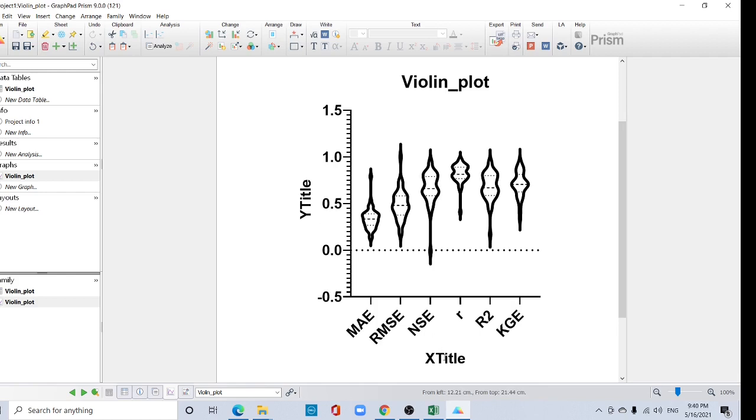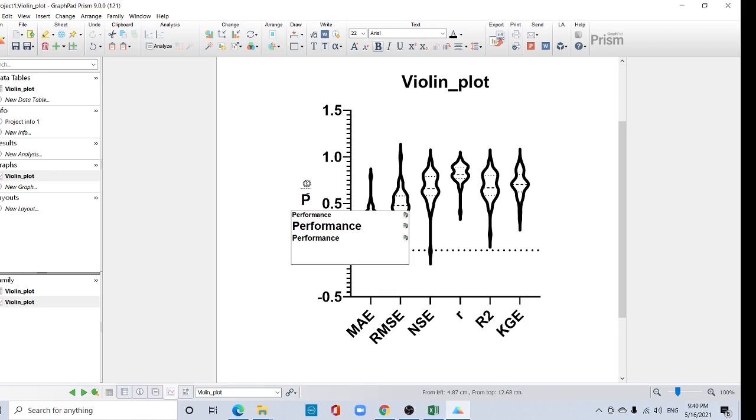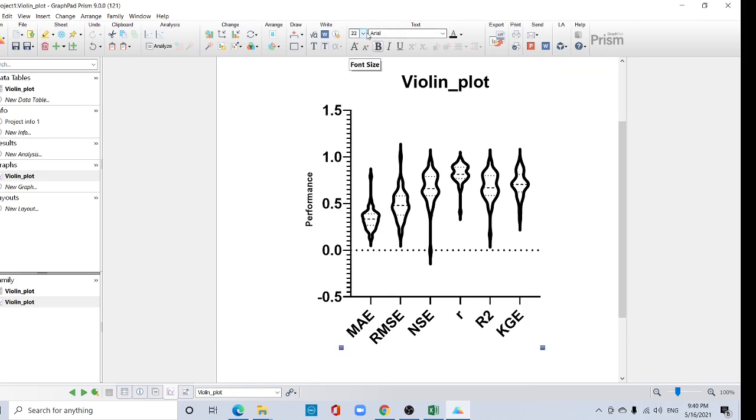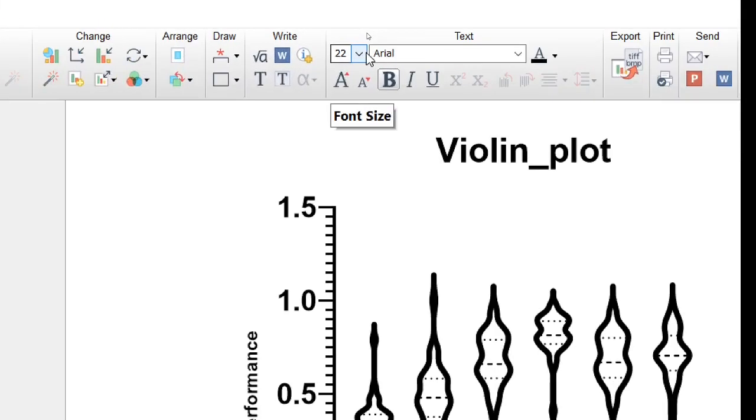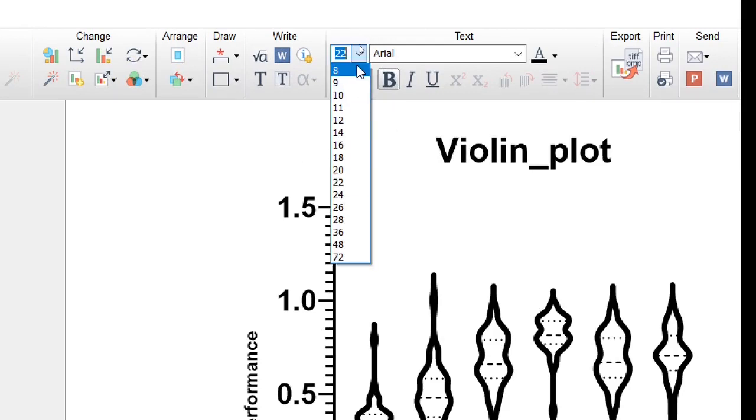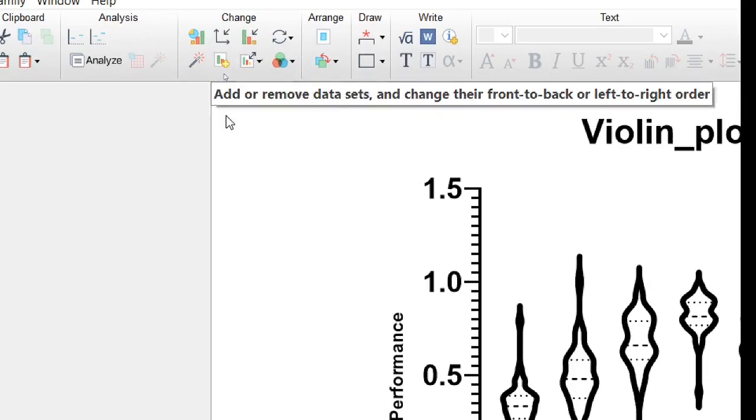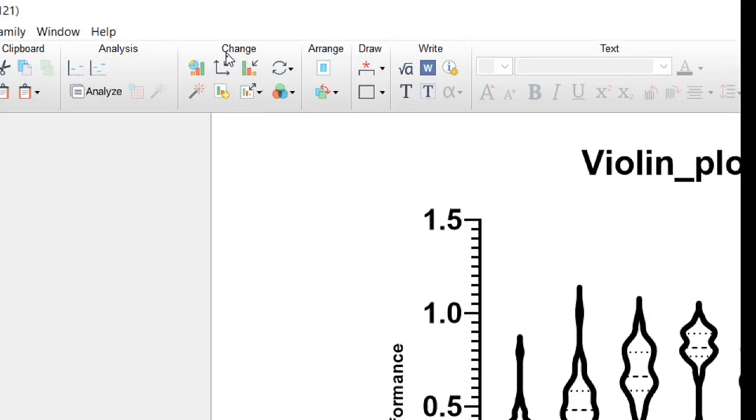Now you have to change this title. If you do not require this axis title, just click it and delete from your keyboard. If you need this title, just click it and type here like performance. Okay, if you want to change the size, just click it here and see here the font size 22. It is better to keep it 14. You can change everything from this step. You should focus only this step for graph section.